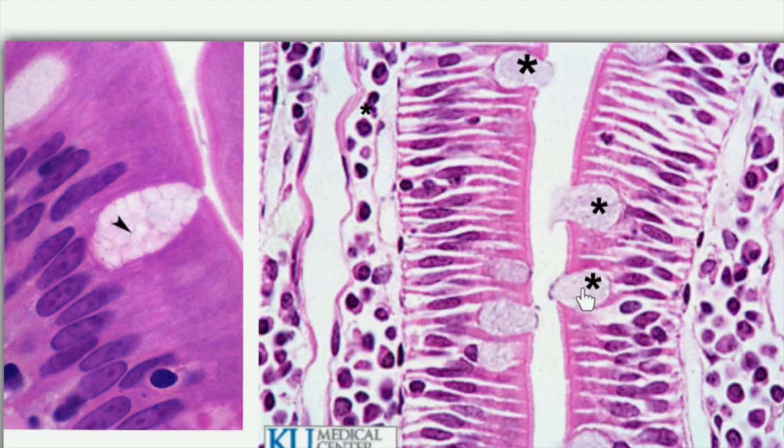The contents of the mucus dissolve during preparation of the section, so it appears vacuolated like this, and this is the lower cylindrical part. And these are the columnar absorptive cells, columnar with basal oval nuclei, with brush border, and this is the connective tissue core of the villus, containing a blood or a lymph vessel. This is a lymph vessel lined by simple squamous epithelium, and here we have the immune cells inside this connective tissue core.